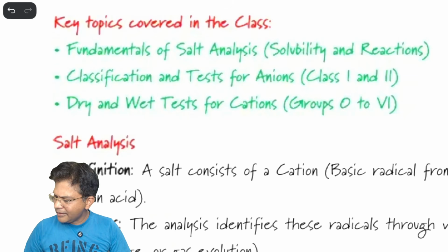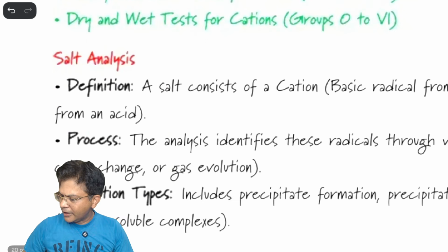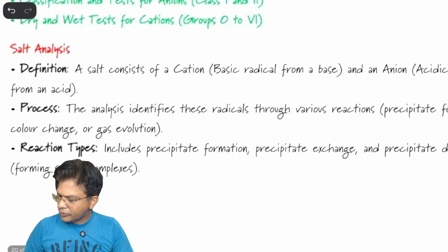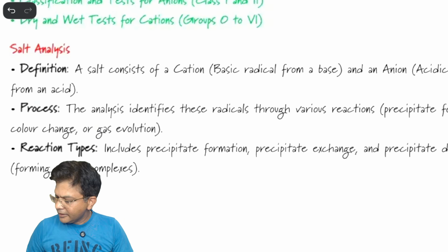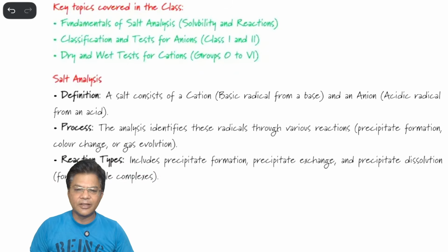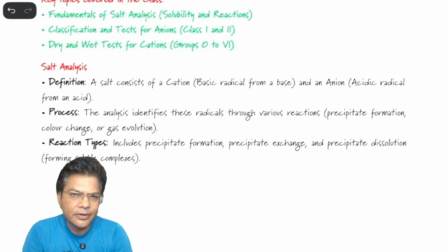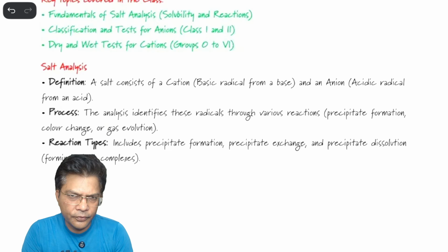Dry and wet tests are not much important, right? So let's see salt analysis. Salt analysis includes precipitate formation, precipitate exchange, precipitate dissolution, and forming soluble complexes. So frankly speaking, when I let you know the salt analysis, we generally have to find out the color, which holds a hell of a lot of weightage.